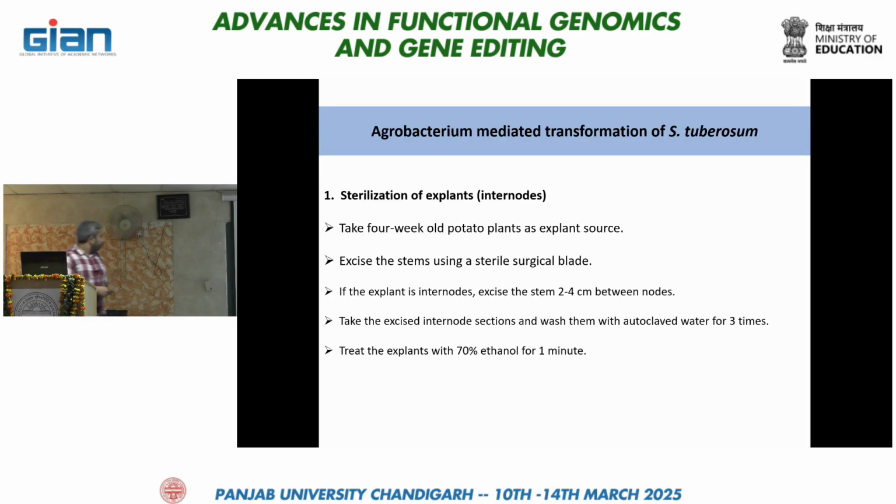Yes. In our case, our plant fully matures in 4 weeks. So we have taken the 4-week-old plant as an explant source, and that will again depend on the type of plant you will be using. And after that, we will be using internodes in the case of potato. We have also used leaves as well, but we are here talking about the internodes.